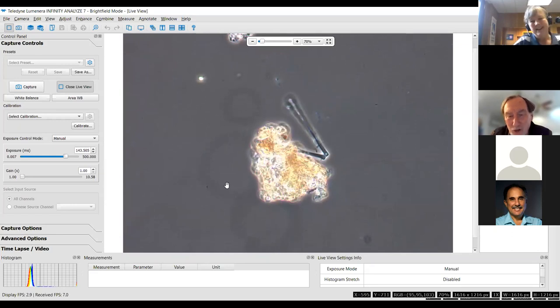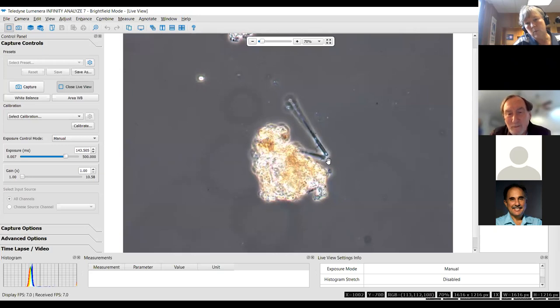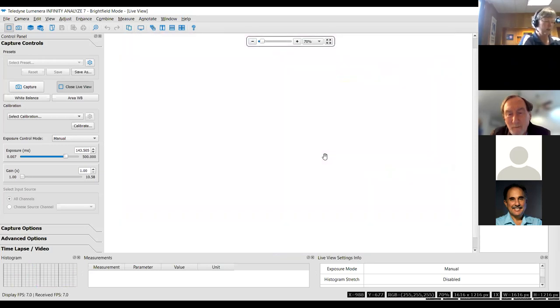Look for cell structures and shapes and things like that. There's a good chance that actually is something there, but that crap up there, and this crap, is not. And this is Asterionella. So it's going to have this really rounded end on one. It's one of those that's heteropolar from one end to the other. And then I just want to find you Fragilaria real quick.